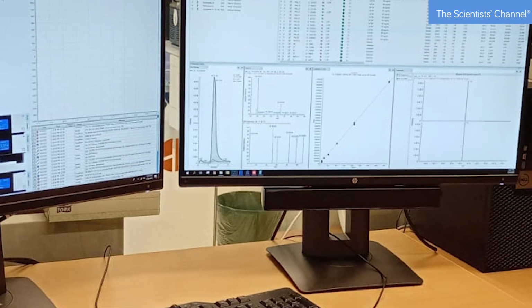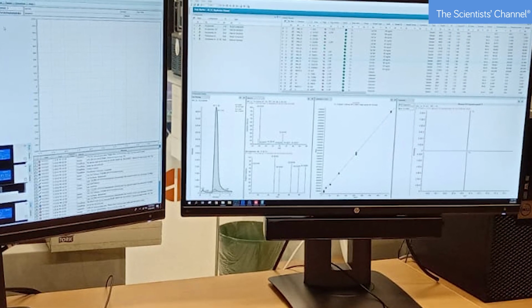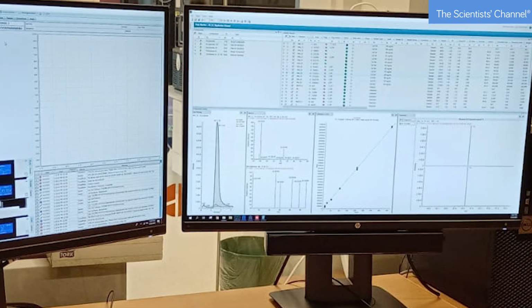There are basically two main challenges that we can address now and extrapolate to further scenarios. The first one is that the vast amount of data obtained from the different acquisition modes on the high-res platform is now automatically processed. And secondly, it is crucial to collect, organize, and compare data to make sense of the LC-MS spectral information that may help to reach conclusions for a particular contaminant.